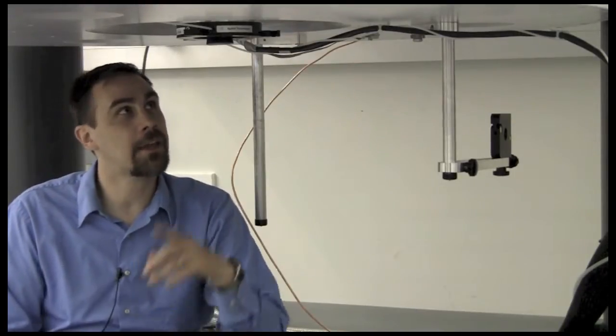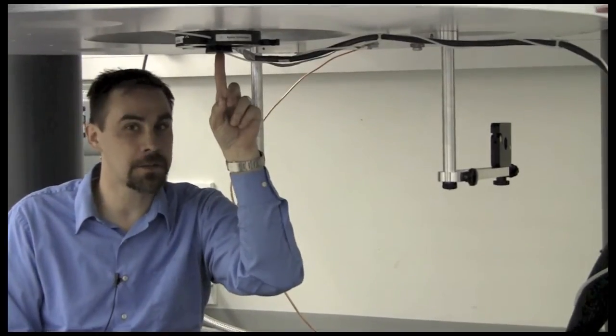Okay, now I'm under the magnet, which is an extremely powerful magnet, and it's most powerful right here, which is in the bore of the magnet.